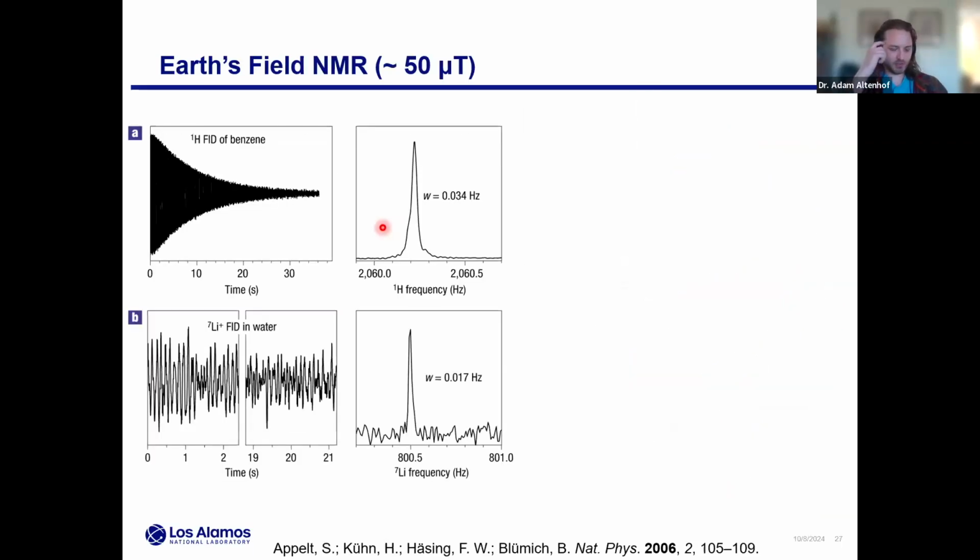So now I'd like to switch over to this Earth's field NMR discussion. The general motivation here is the same question: can we use this sort of low field spectroscopy to do some meaningful detection work or characterization work for fentanyl? Now, before getting into any background, I think it's nice to just show why we'd want to use this, sort of let the data speak for itself.